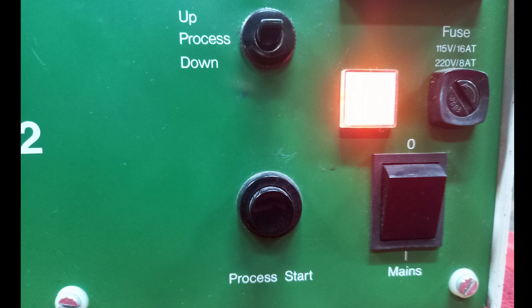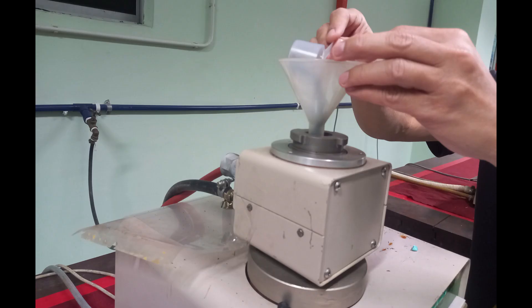In this video, we will see about hot mounting. In hot mounting, the specimen is mounted under heat and pressure with a hot mounting press.